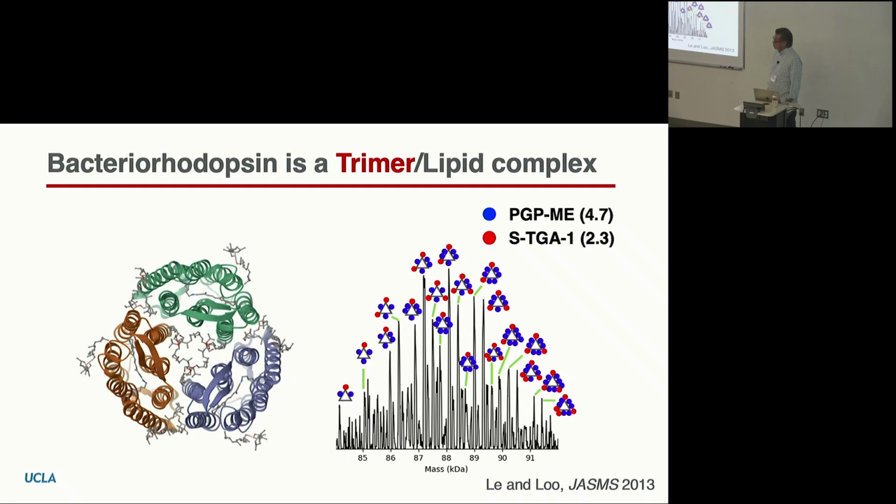So then you can use it for identifying de novo interactions. Right, so if you just have a mass shift, you know that something that weighs 700 binds to your protein. If you think it's a metabolite, then you go to Aaron's talk this morning to figure out whether it's in the Metlin database, or you go to the lipidomics talk, which is downstairs, and figure out whether a mass of 700 matches a particular lipid, or you resort to tandem mass spectrometry, what Josh was talking about, and try to fragment this 700 Dalton thing and see if you can get structural information. So there's a lot of detective work, I would say, to identify unknown ligands.